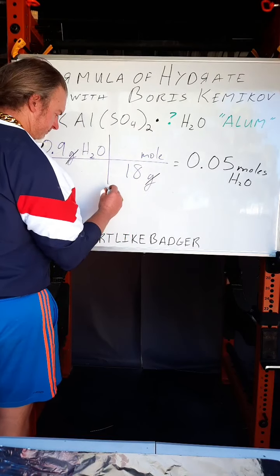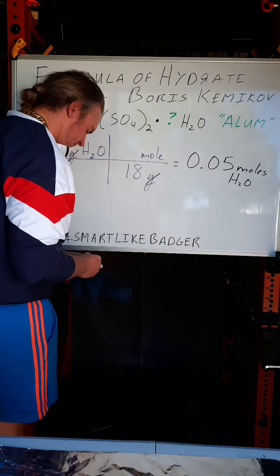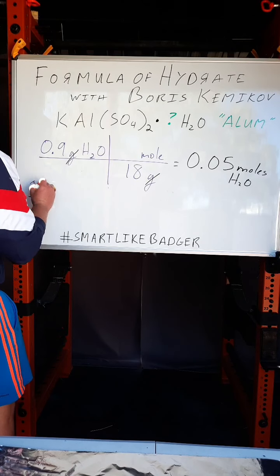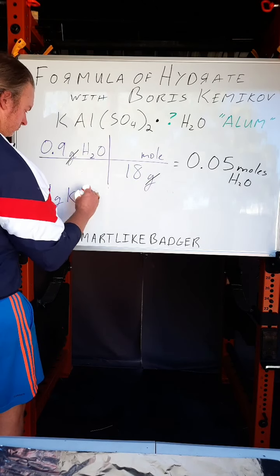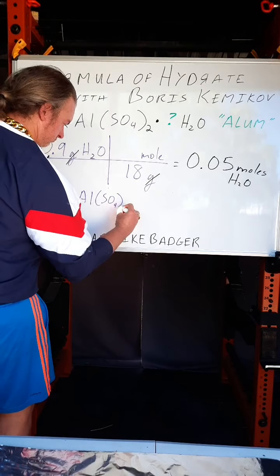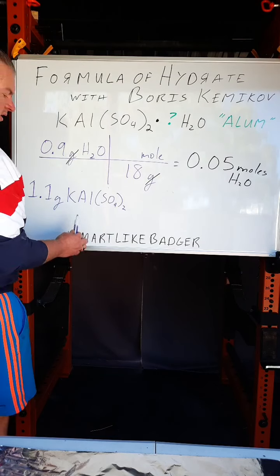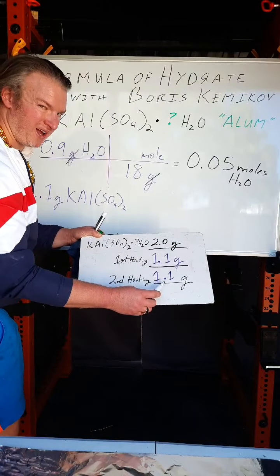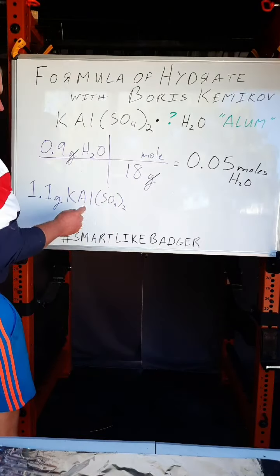So that is how many moles of water. This is the grams of potassium aluminum sulfate, dry anhydrous, after the heating.